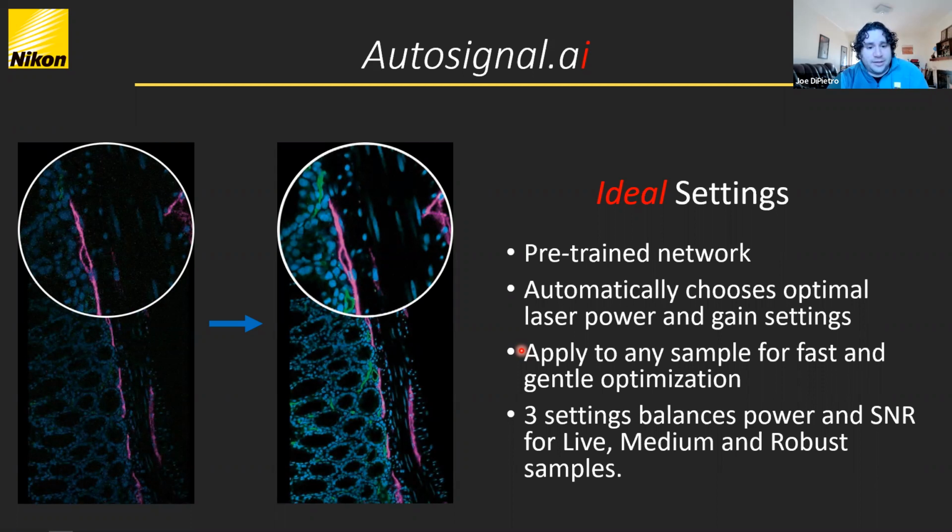When I find myself on confocals that don't have it, I'm like, oh yeah, I have to do this all by eye and do some tests to make sure that my image is quantifiable.